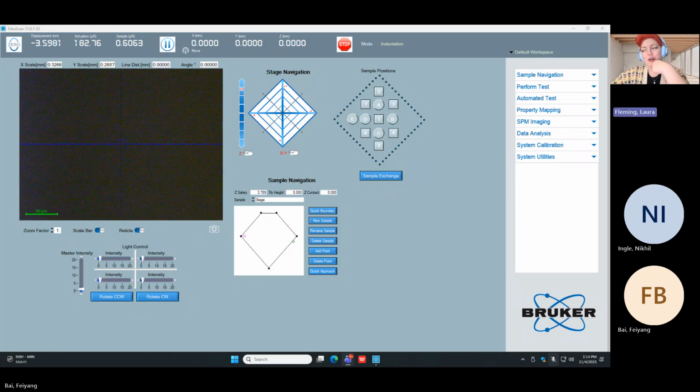Okay, there we go. So we are now hopefully back where we started, but I would like to go through the setup again. Whenever we update the software, which hopefully isn't too often, we run the risk that the workspace has been corrupted or the sample zones are not precisely the same, or other things. So we still need to go through our 5 steps from start to finish.